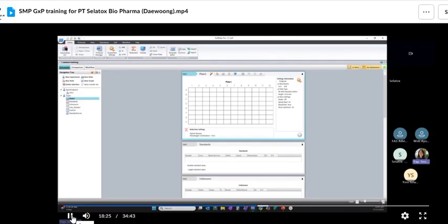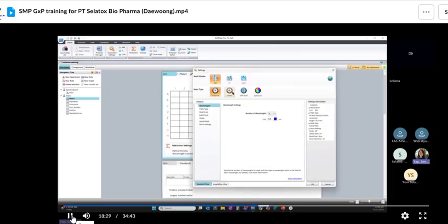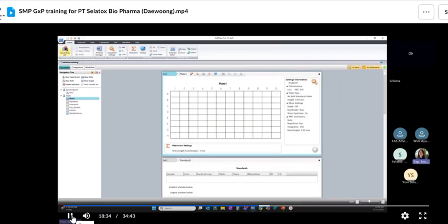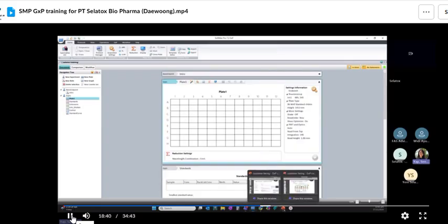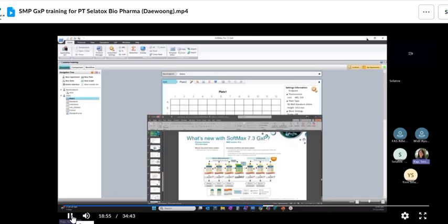All right. So assuming I have set up my experiment and so on, I connect to the plate readers and run. Then I set up all the formulas. Once I'm happy with that, let's say I have optimized everything, it's good to set up an official protocol and proceed to the next step, asking the lab manager to review. So the lab manager can review and release it as an official protocol. So I'm going to do this.